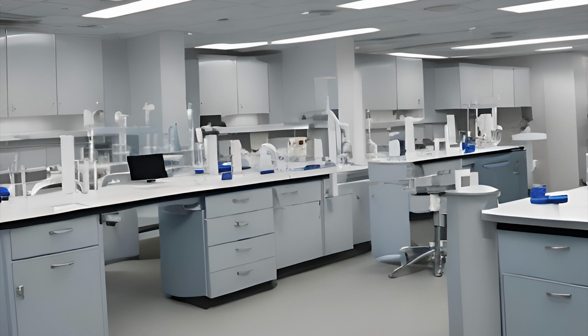Errors that can occur during specimen transport include a delay in transport, especially on a time-sensitive specimen. One that will oftentimes be collected by the nursing team and then brought down to the laboratory is a test sample called a wet prep. You are frequently looking for things that are still alive and moving that were collected from a human body on a wet prep sample.